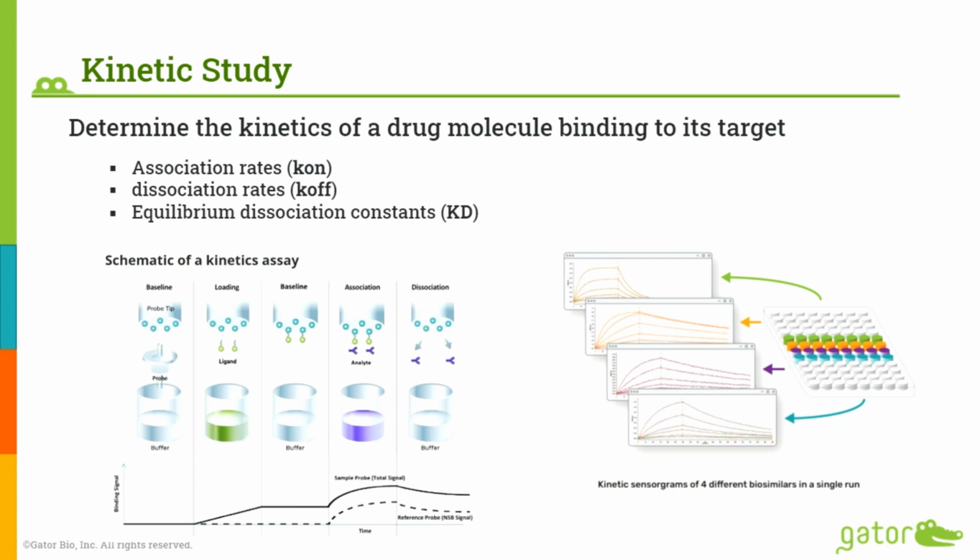So this is a periplasmic solution. For periplasm, we cannot do quantitation, so we cannot determine the association constant. All we can do is determine the dissociation constant, which is the off rate. And we can rank these periplasmic solutions based on the off rate. So the stronger the binding, the tighter the off rate, right?